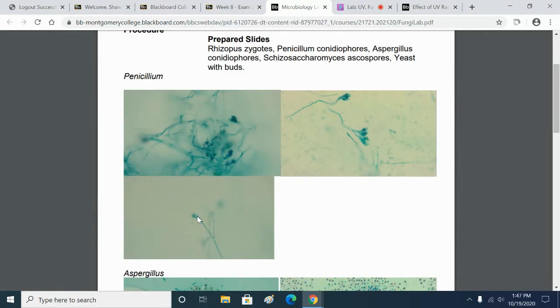When the fungal colonies start getting colorful, that normally means that they're producing spores. And fungal spores are for reproduction, not survival as with bacteria. Fungi produce a lot of them, and they're very light. Just a little bit of air movement, and they take off and fly around. And if they land someplace which has adequate food and moisture, they can germinate.